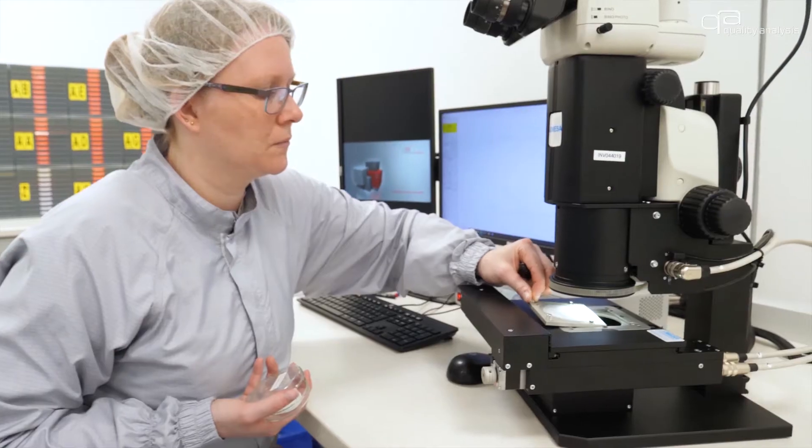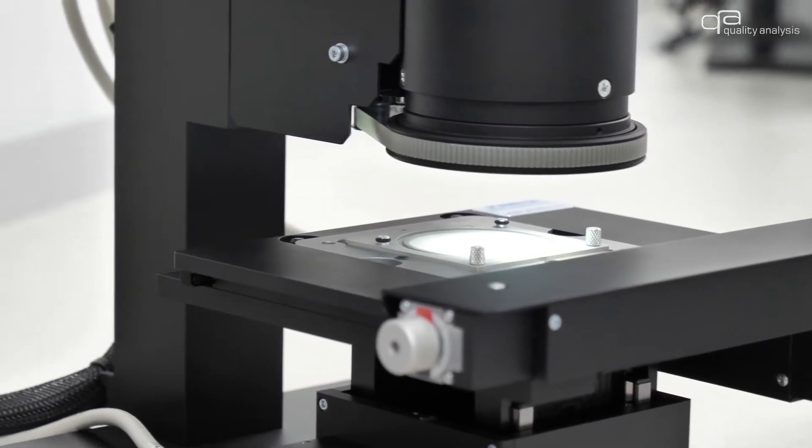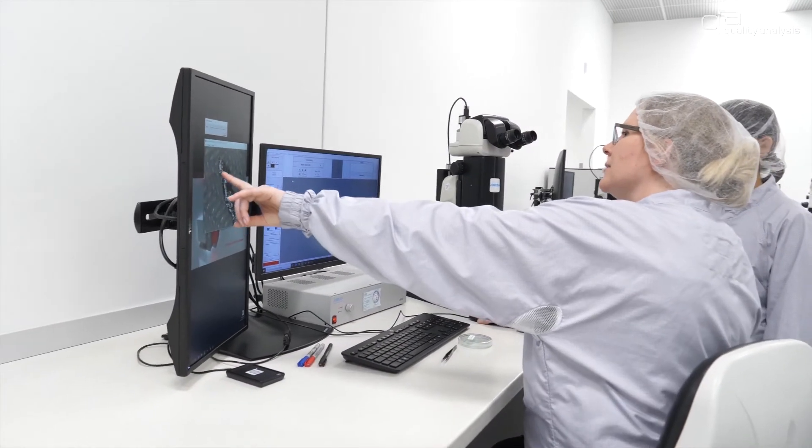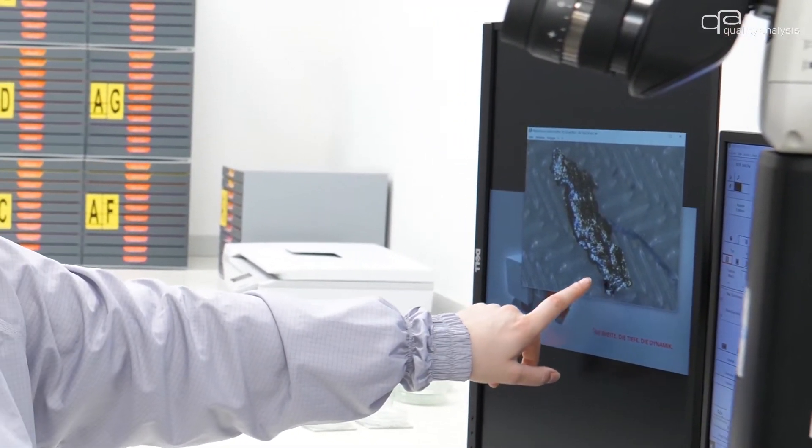After the extraction the different particle types are detected using reflected light microscopy. A differentiation is made between fibers, metallic shiny and non-metallic shiny particles.